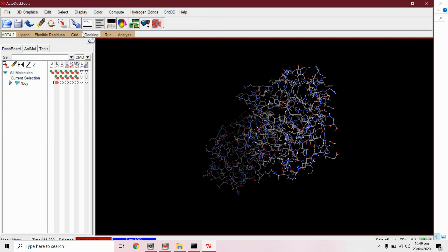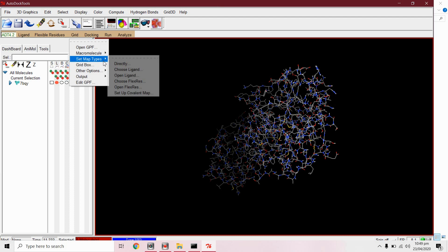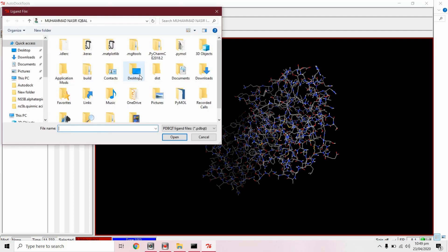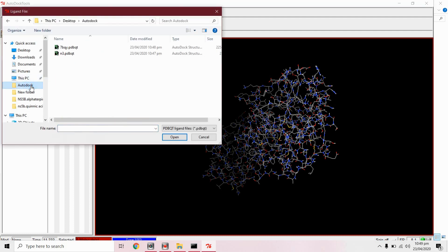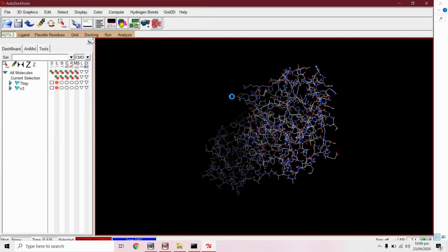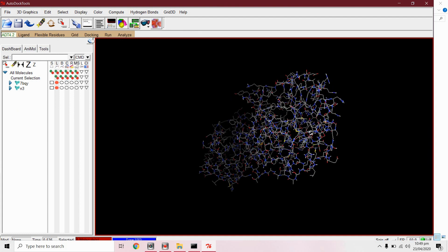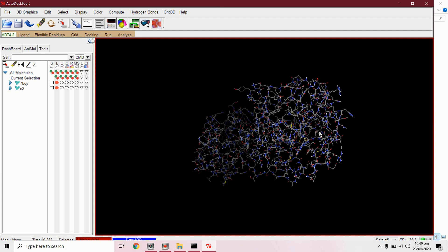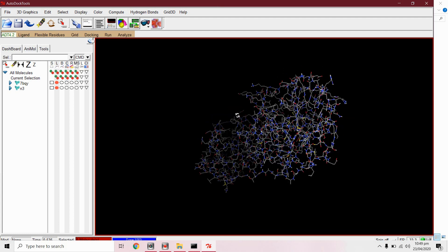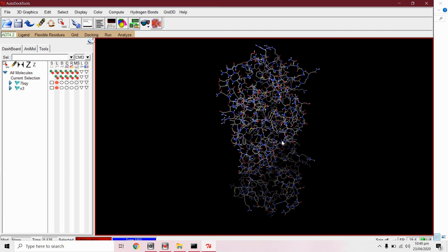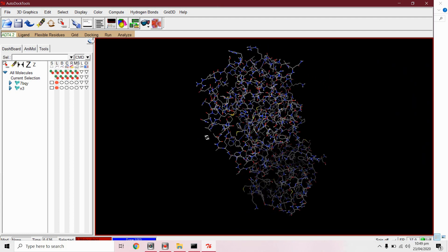We will form grid, set map type and open ligand. We will open this ligand dot PDBQT file. Now we will select the grid box around this protein.